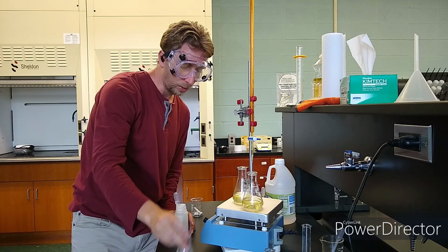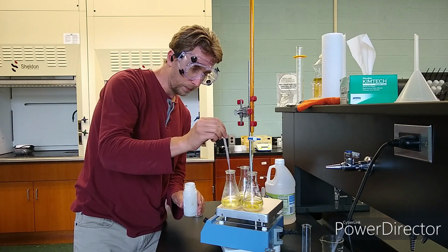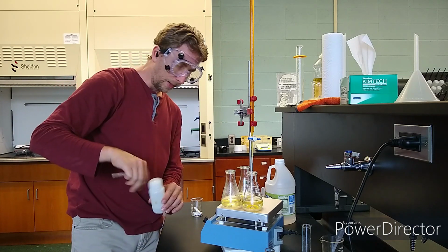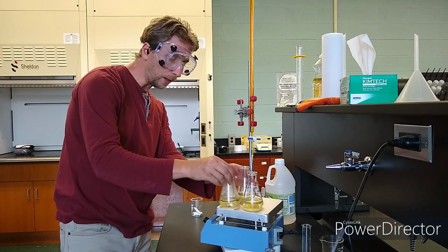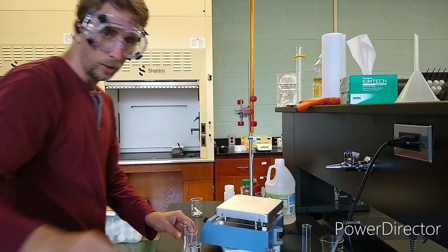Okay, I put 1 squirt in each of those. Now I need to put 1 squirt in this one. 1 squirt. All right, got that. Okay, there's my 3 starting solutions. Let's take a closer look.